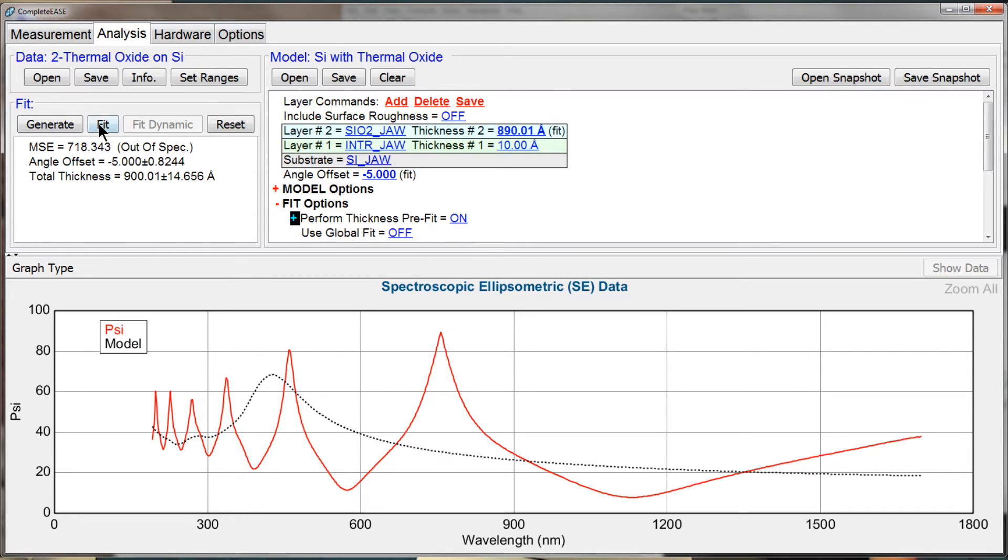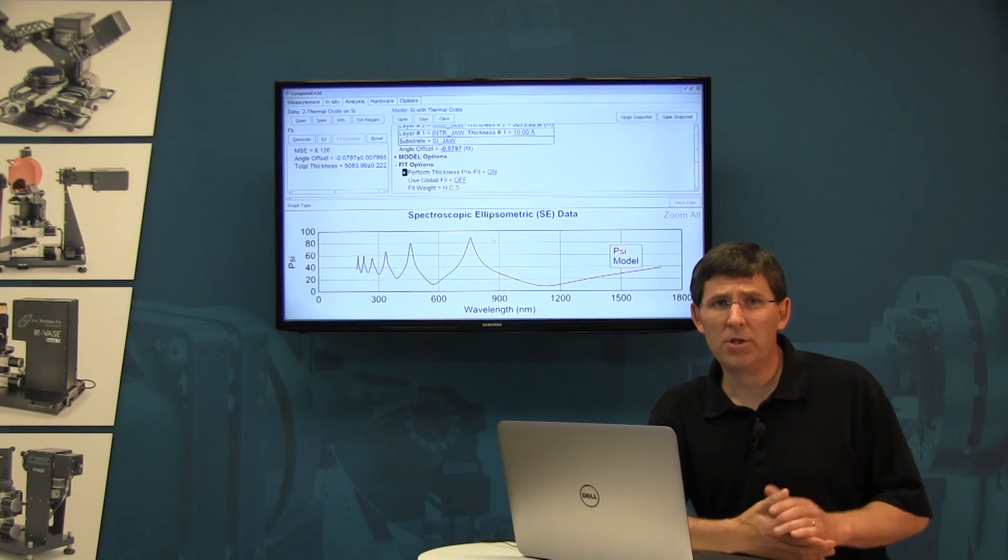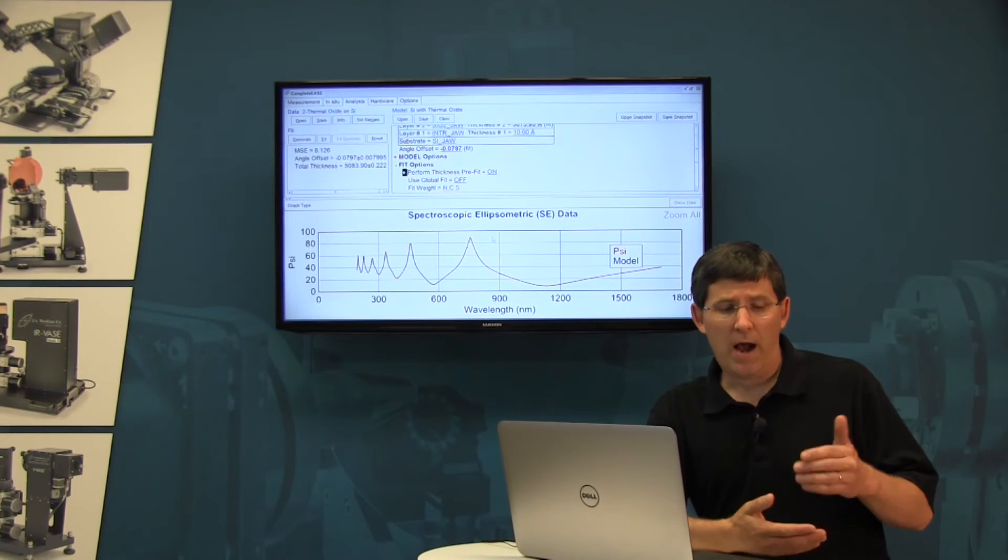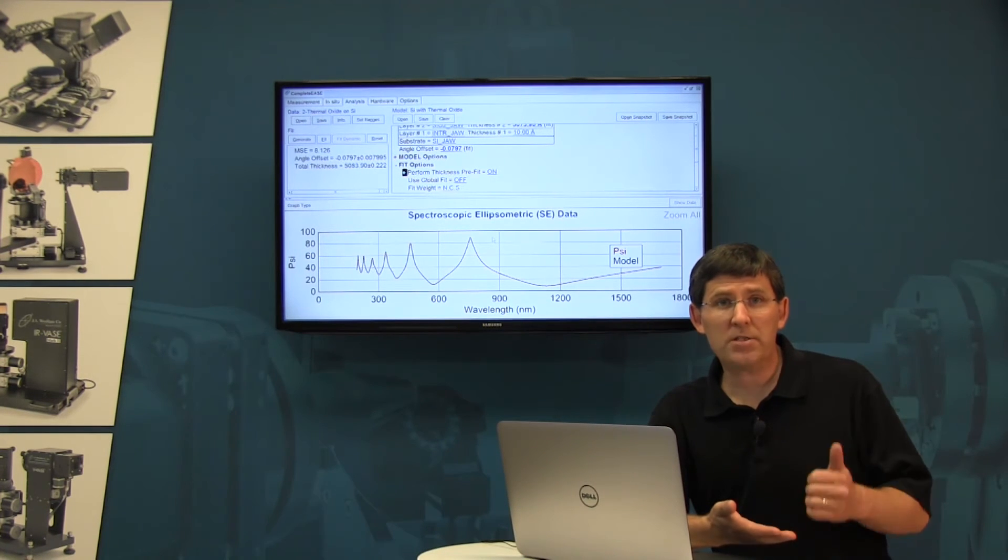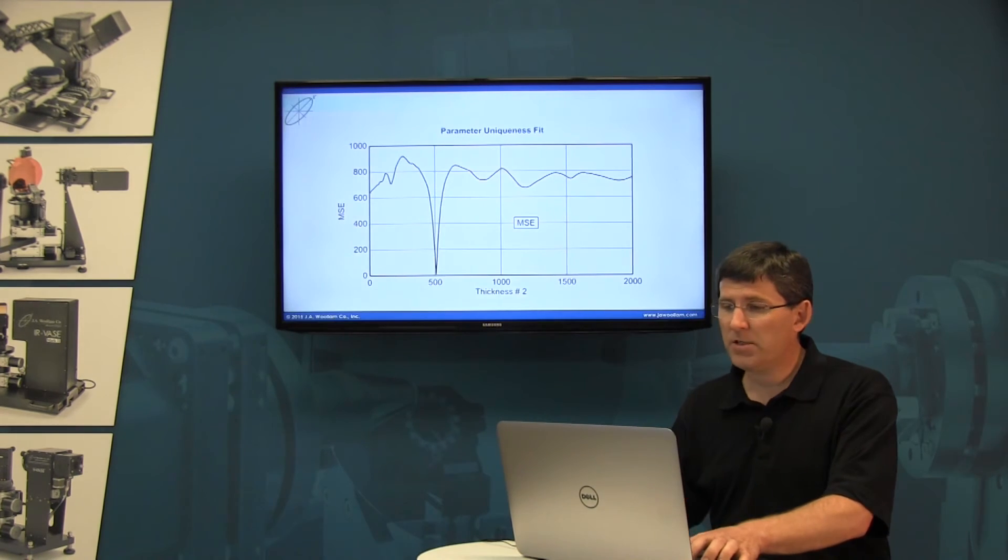Notice that now when I press fit, it immediately jumps to the correct solution. And that's because the thickness pre-fit is doing something very similar to the way our brain works. I saw that there were lots of oscillations. That meant the film had to be thicker.